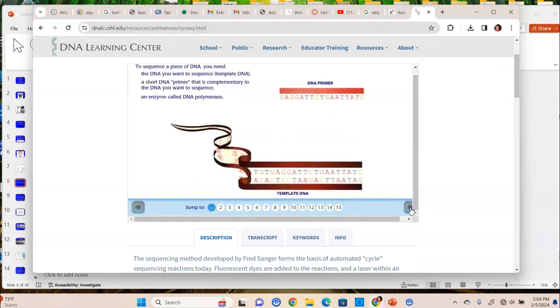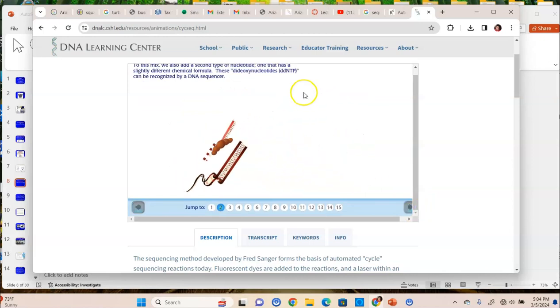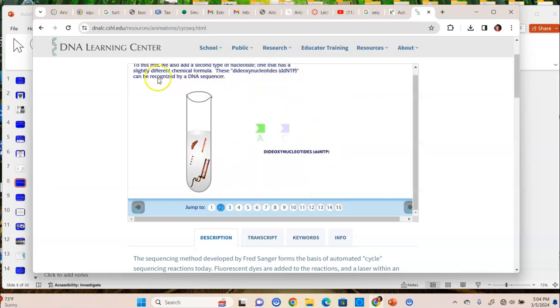You're going to need your temp, just like we talked about. So for sequencing, we'll need our polymerase, our primer, our template, our nucleotides, right? And for Sanger sequencing to work, if we're going to do PCR, this would be great. But for Sanger sequencing to work, we have to have dideoxynucleotides, right? These. And so they're going to terminate this sequence. We can do the reaction all in one too, because the laser can tell green and blue and red and yellow apart. If we were doing radiation, we would have to do it in four separate tubes.